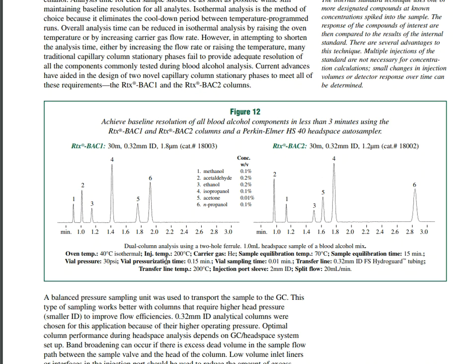So how long does it take to get there? And then the vial sampling time is 0.01 minute. So that's literally a quick puncture of the vial, suck out the top, and transfer it over to the GC system.